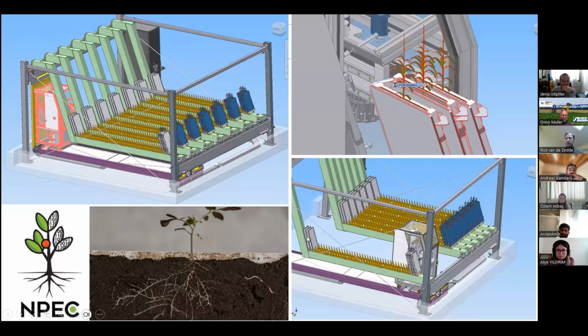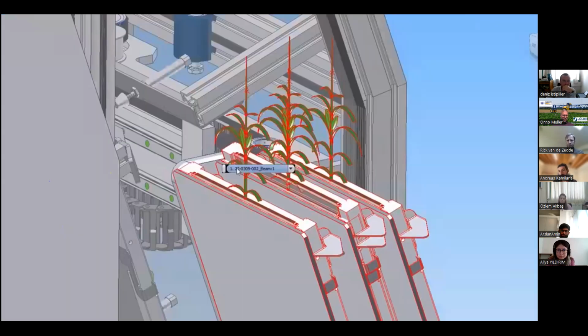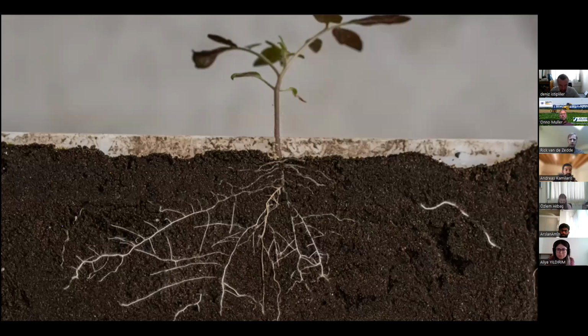And then we can actually see the root growing as an imaging system takes these plates one by one from these lanes and scans it with a top view camera, a side view camera, and a root, basically a flatbed scanner. And this is actually the imaging device in which we take these images, and everything is completely automated. So this is expensive, very complicated, but from our end needed to objectively measure root performance differences between species, between genotypes.